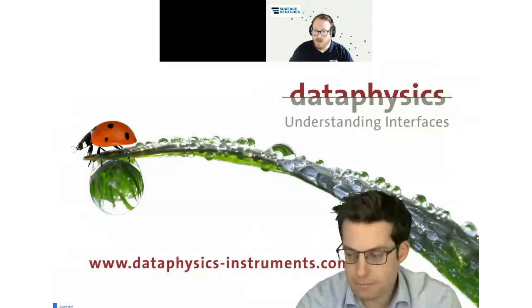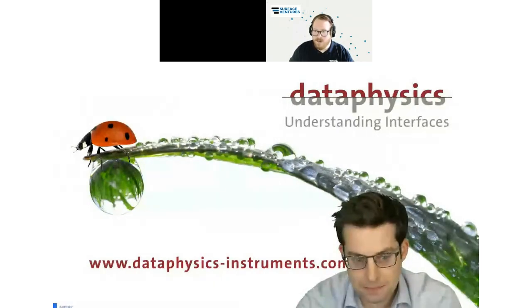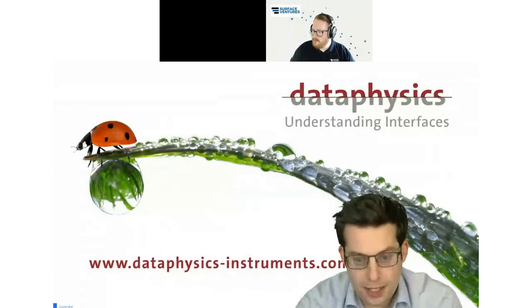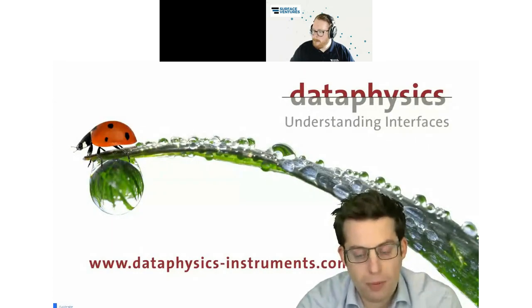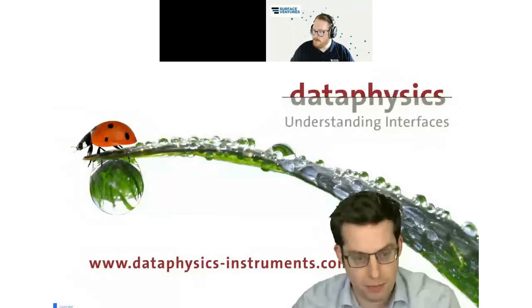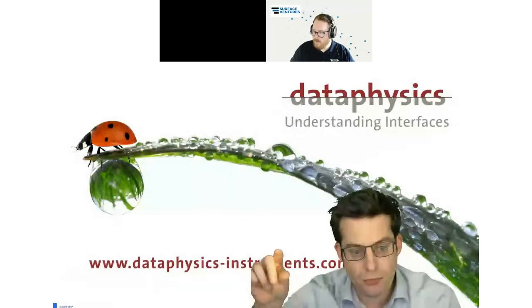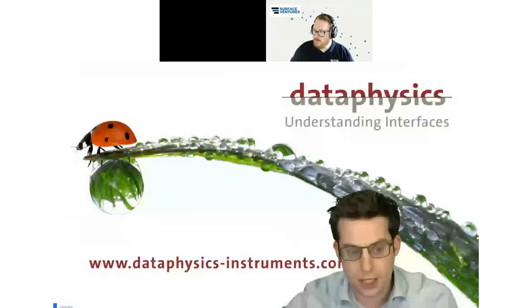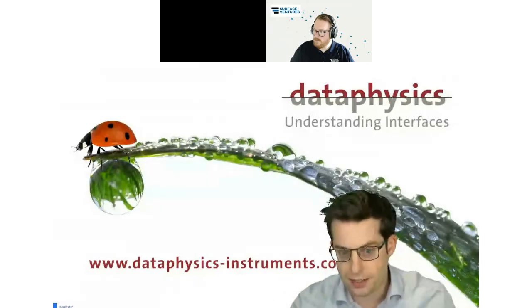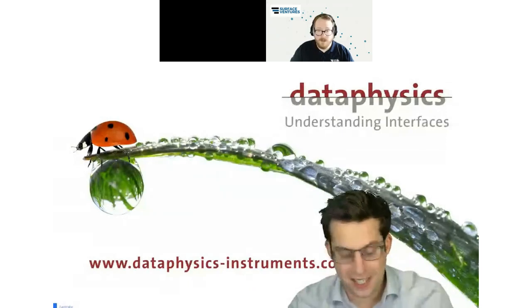So how light in weight can the solid be for measuring? How light of a thread is capable of being measured? Do I understand this correctly? You want to know the absolute weight of the fiber that can still be measured? Or if you have a fiber that is only 1 milligram in weight, is the lamella forming at it still heavy enough to be detected? I believe that's what they're asking.